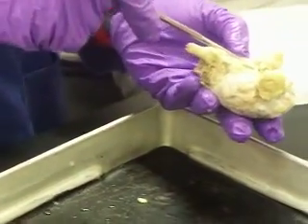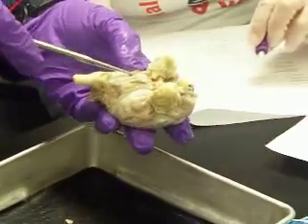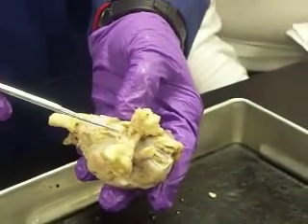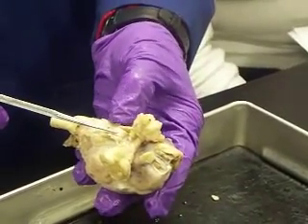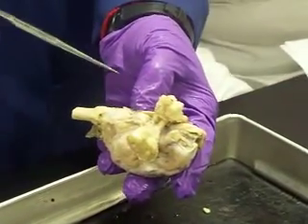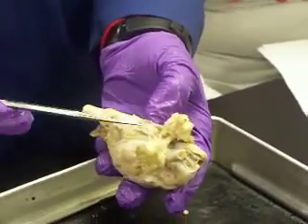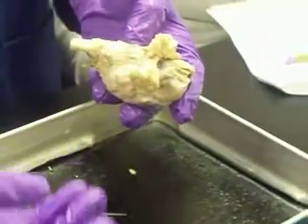That's what we used to consider the master gland of the body. That's the pituitary gland. So production of growth hormone, releasing of antidiuretic hormone, releasing of oxytocin, and so on. Oxytocin helping out in childbirth, contractions of the uterus. By the way, antidiuretic hormone and oxytocin are actually produced in the nervous system, but are shuttled to the posterior part of the pituitary gland. Now you're only going to find it here, but then we're going to cut that and it's going to be removed. So in the future, when you want to find the pituitary gland, it's going to be connected to your meninges.